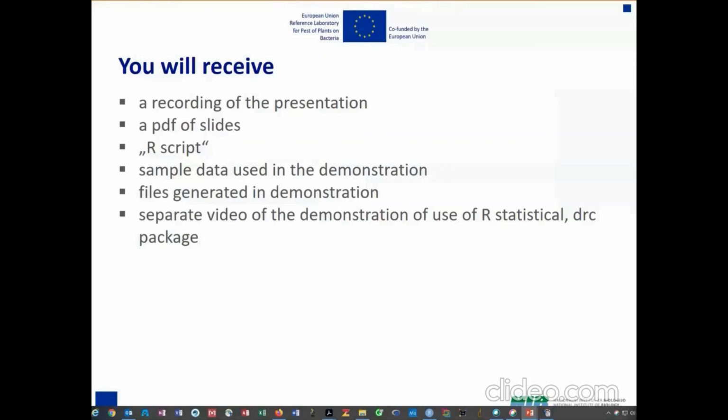If we want to improve detection at low levels, we can actually see it in this way. And of course, this also means that we can all try to report not the same number, but a similar one, looking at the same point. For example, deciding, okay, I will report for my test the LOD at 95% probability of detection, and I will report the concentration at which this happens.